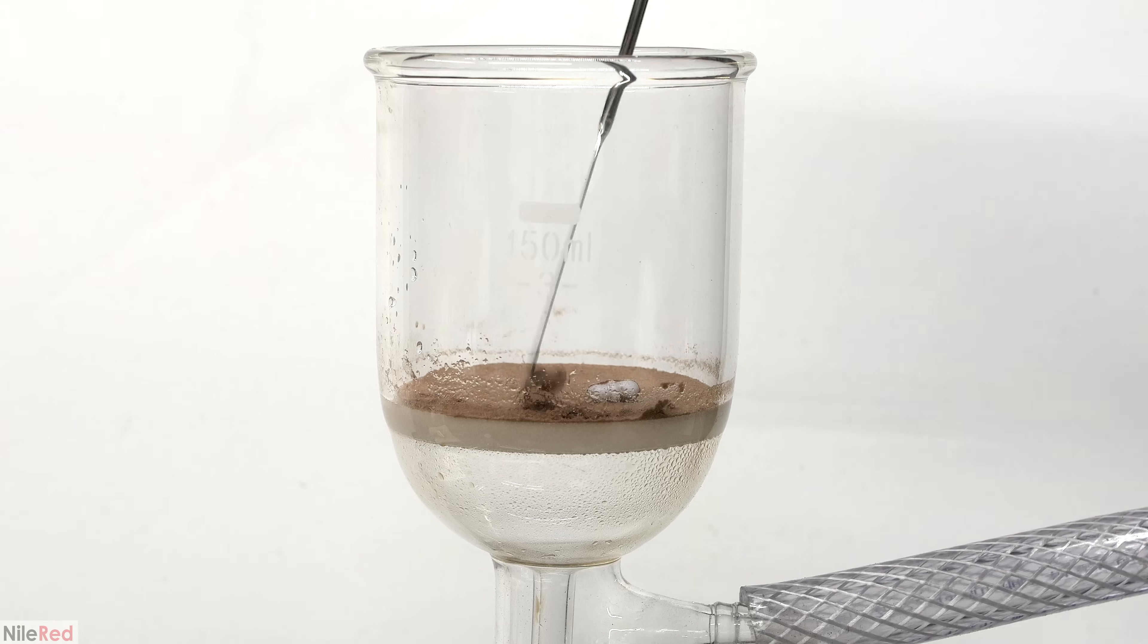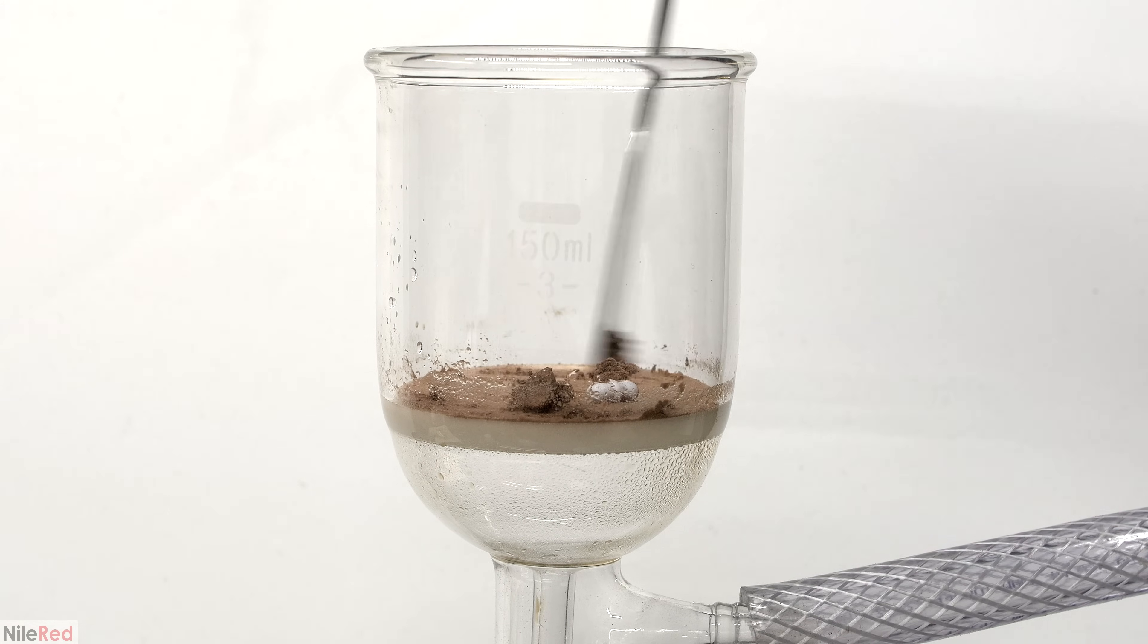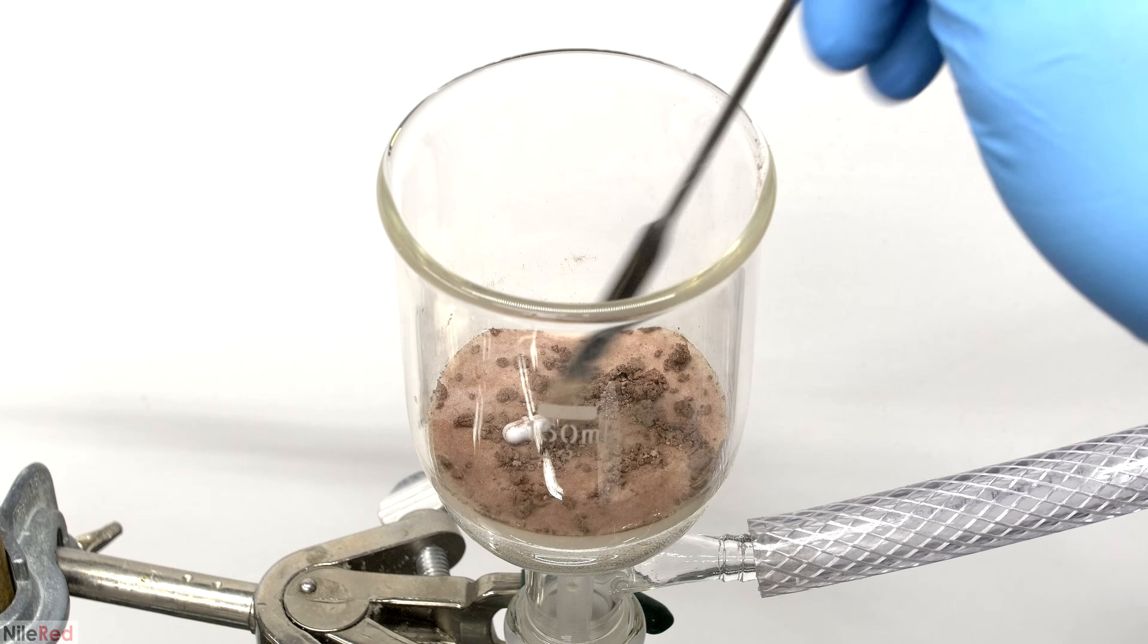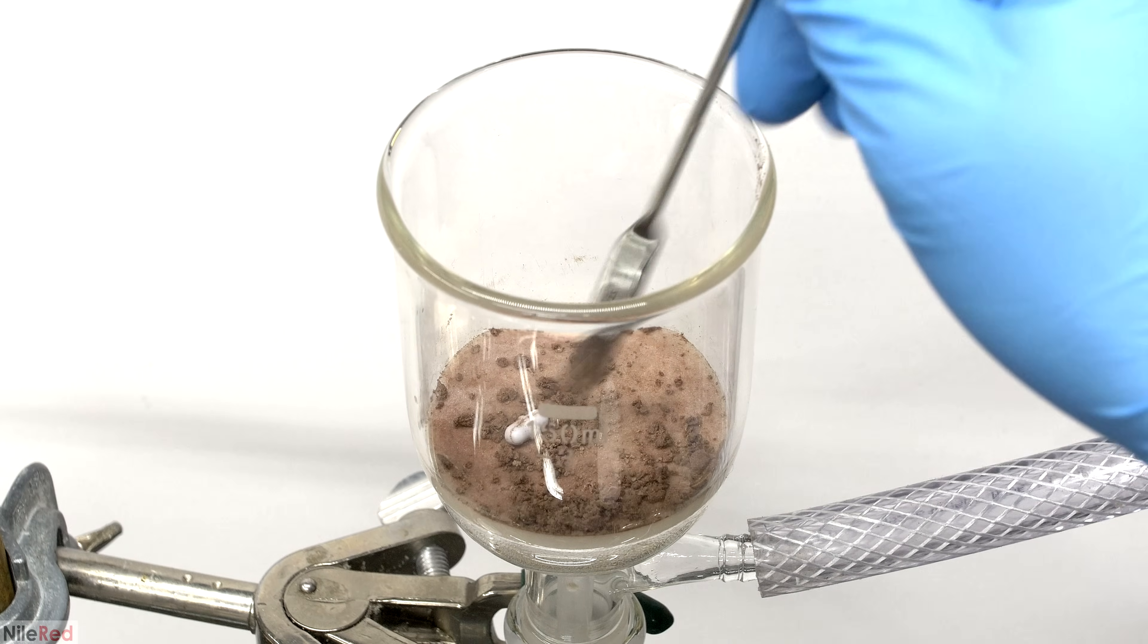Once I was done with the washing steps, I used a metal spatula to scrape off the product. I keep the vacuum on to dry it up as much as possible, and I'm eventually left with a powder that looks a lot like the p-aminophenol that I started with.